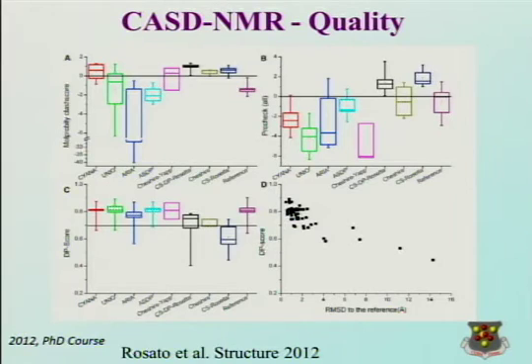And why is that? You can think, even if the prediction is just a completely unfolded polypeptide, that's not going to satisfy the data, because the data tell you that the protein should wind up and bring atoms together close in space.